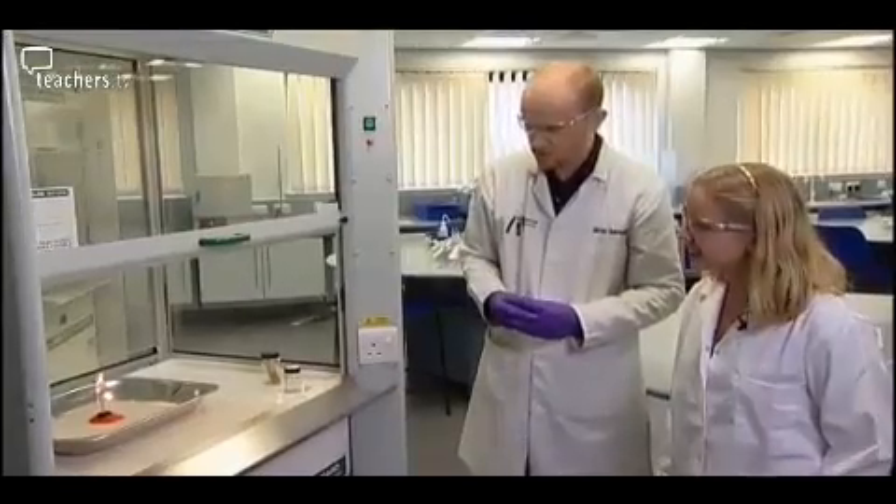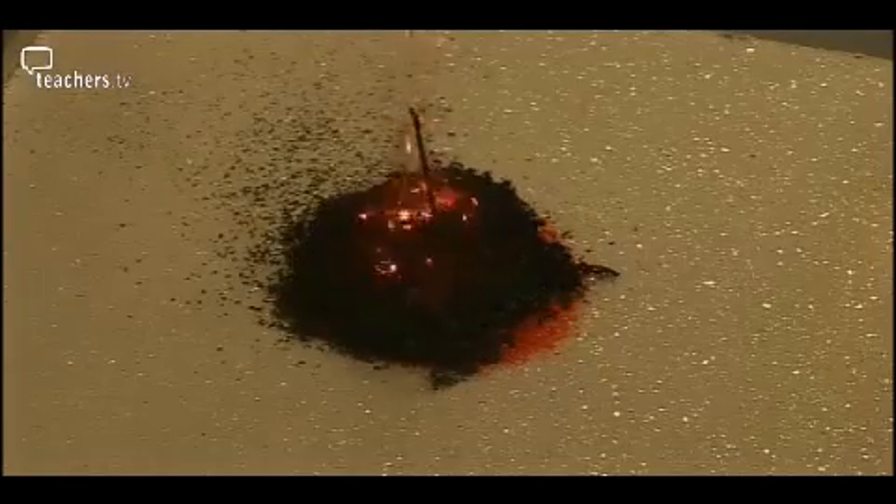We can start to see the chromic oxide being formed. The chromic oxide can then be used in the fireflies demonstration.